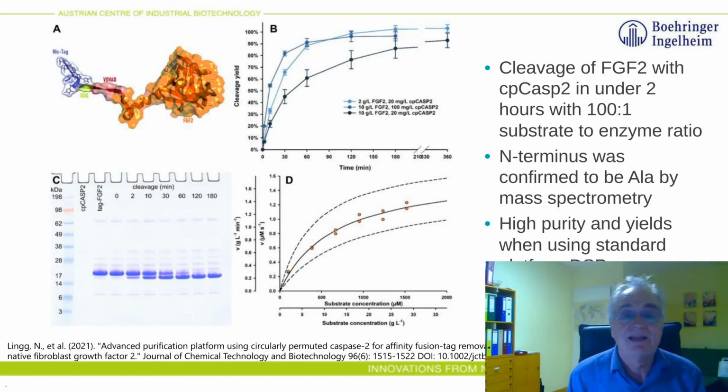On the right-hand side you see the cleavage kinetics, and also the kcat. This is interesting for those who are interested in enzyme kinetics.